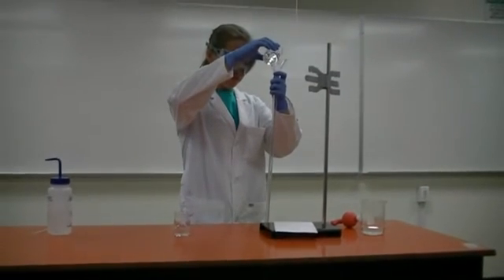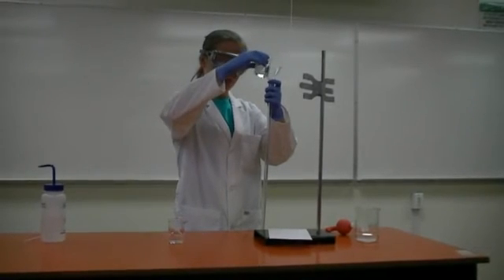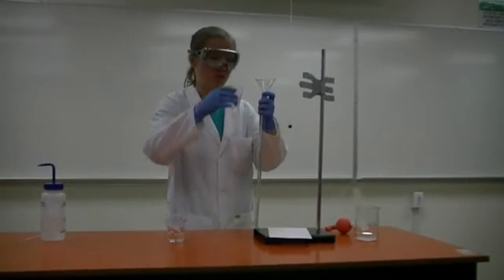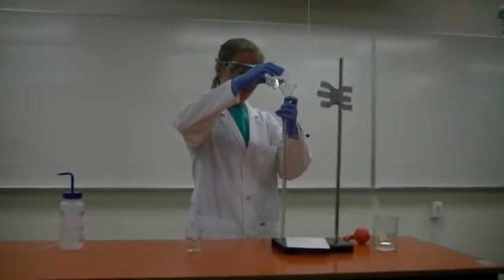Use filling solution only at this stage. Fill at eye level and use a funnel to ensure that you don't have spills.